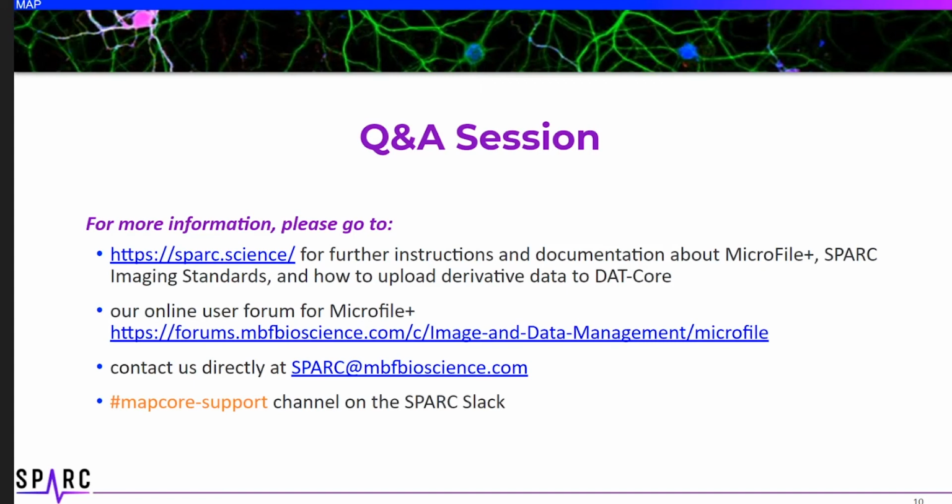How do you determine the XYZ distance information if it's not available in the metadata that populates when you open an image? I think that question is why it's so important to record this information. The person who collects the image at the microscope should have an awareness of the scaling due to the optics used at the time of acquisition.